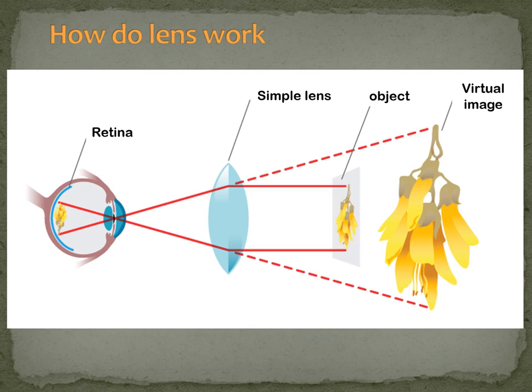But because of this refraction of light, there's a phenomenon where the image is in fact amplified, because the image that forms in here is again as if the light ray was coming from this position and from this position. So the image that the eye is forming in the retina is in fact a virtual image of this side.